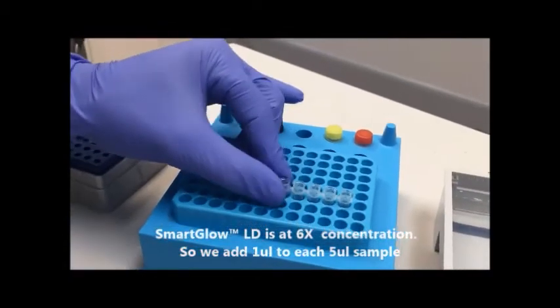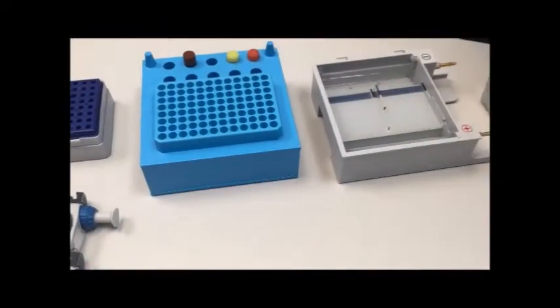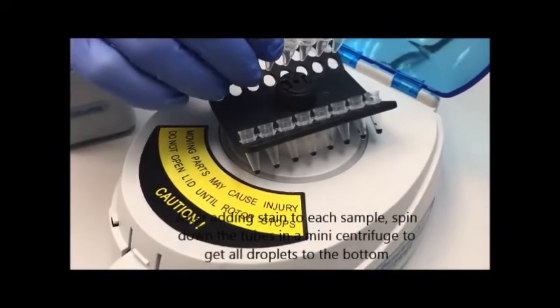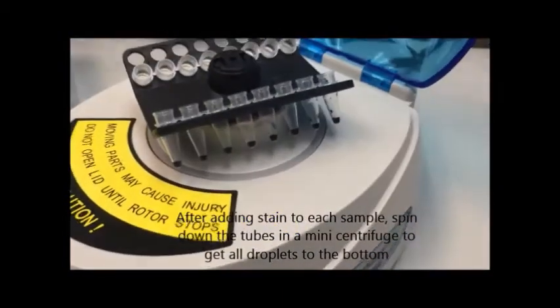After adding all of our markers and DNA stain to our tubes, we are going to again spin them down in a mini centrifuge to get all of the droplets to the bottom.